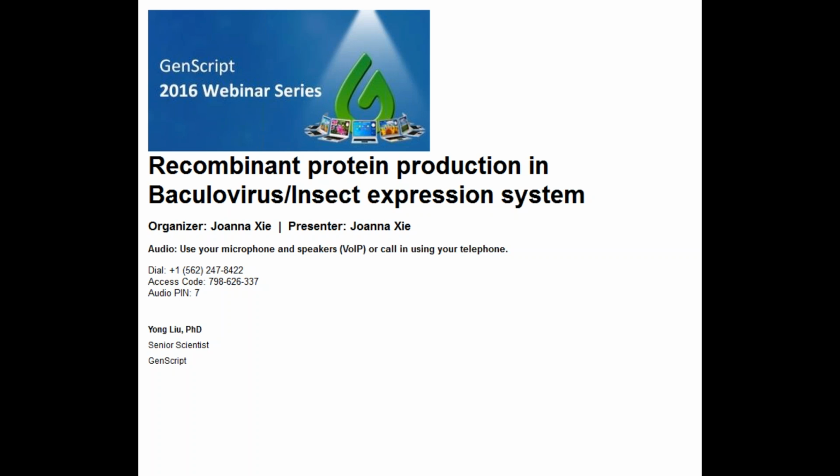So if you're expressing a secreted protein, we have found that you can improve expression by using the Hi-Five cells. And the optimal MOI, multiplicity of infection, will vary between cell lines and the relative infection kinetics of the virus isolate or clone used. We recommend that a dose response be established for each virus, medium, reactor, and cell line employed to determine the optimal infection parameters to use for protein expression. Generally, as a starting point, you could infect cells using an MOI between 1 and 5.